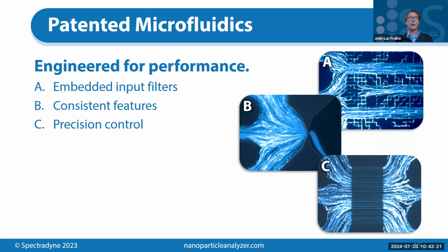So I'm not sure how you would compress a particle except if it's maybe getting squeezed as it goes through the constriction, but that would not be a high quality measurement, I don't think. So to the extent that we understand how the system works, particle compressibility does not impact the measurement at all.